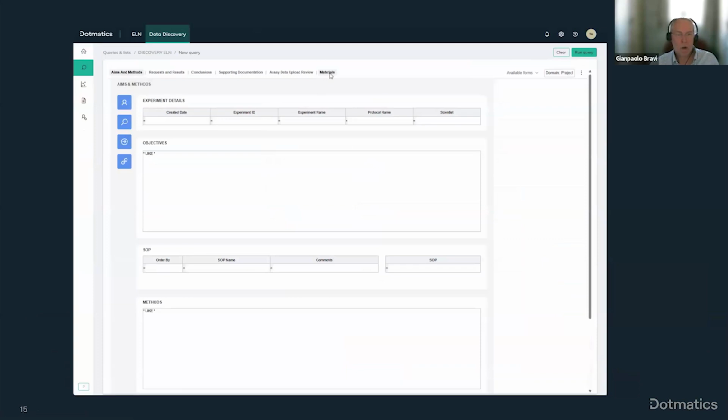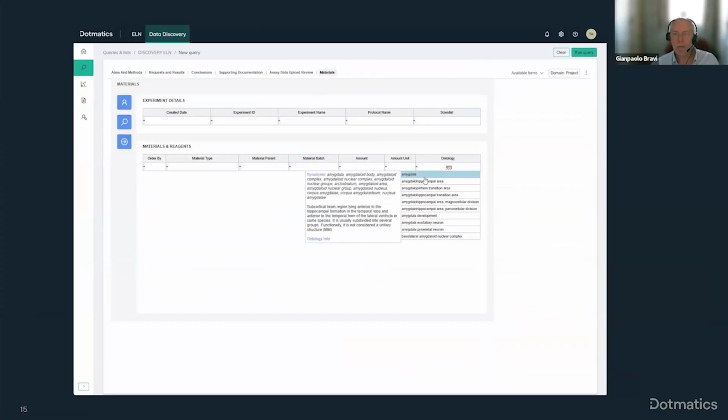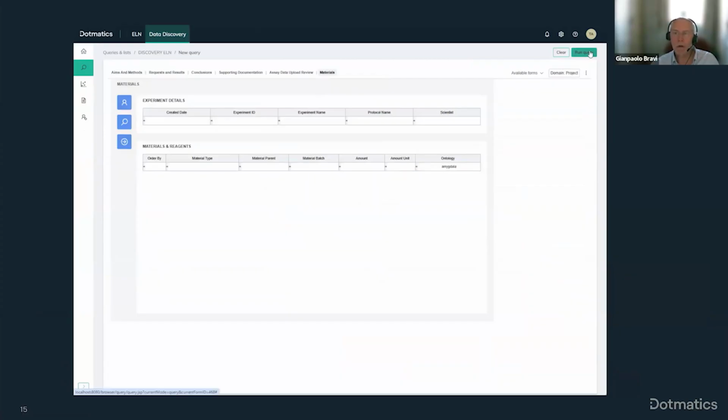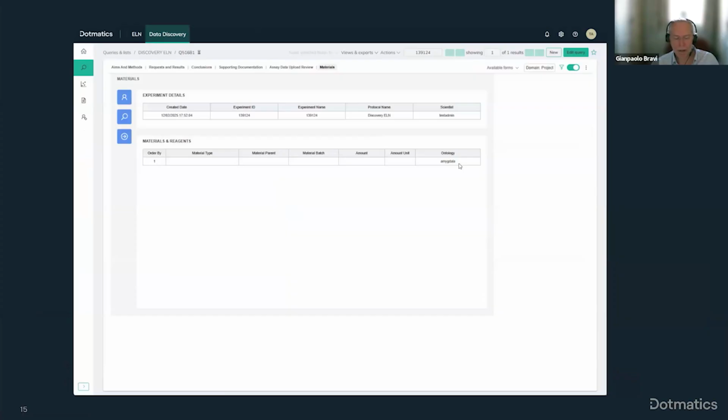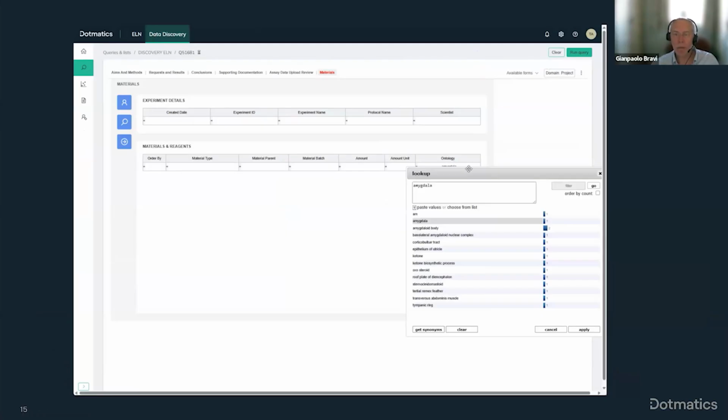From the home page, we create a new query. We then use the type ahead menu to select an option. We run the search and we retrieve one hit. We now go back to the query, we double click and open the lookup.